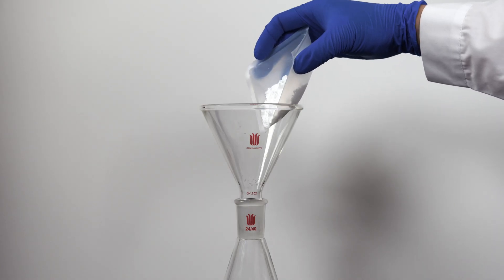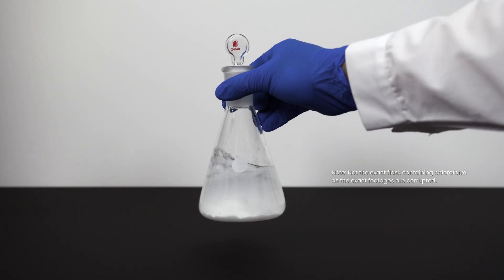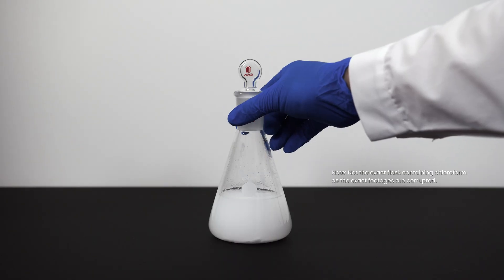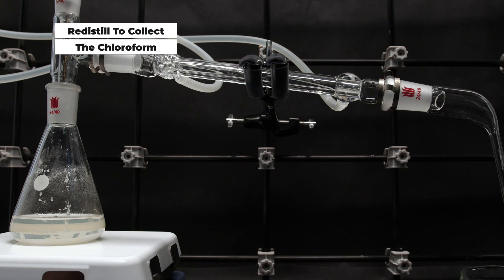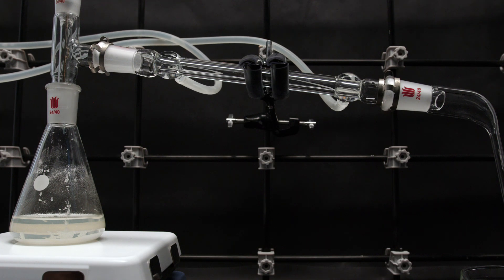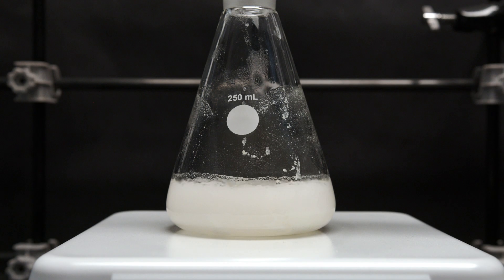Add a small amount of anhydrous magnesium sulfate to the chloroform, swirl it gently, and allow it to sit for 20 minutes to absorb the water in the chloroform. The final step will be a distillation of chloroform to get rid of most water and other impurities — a simple distillation will be adequate for this purpose.